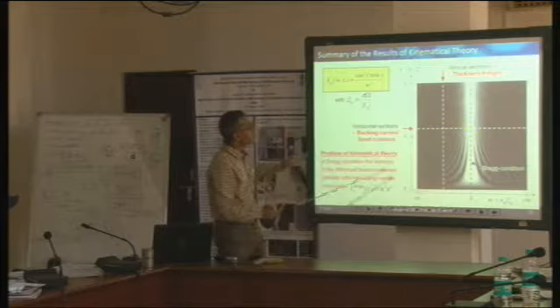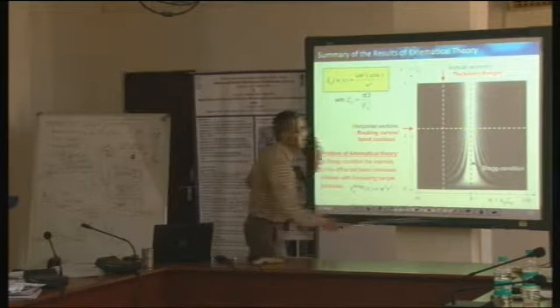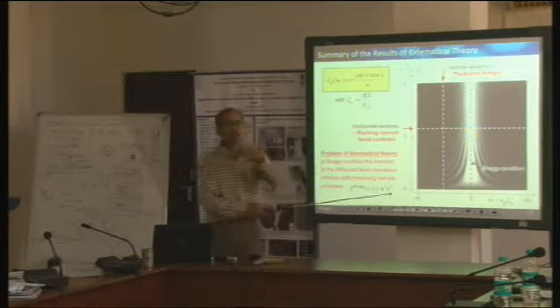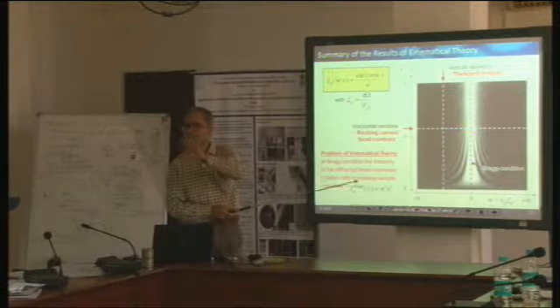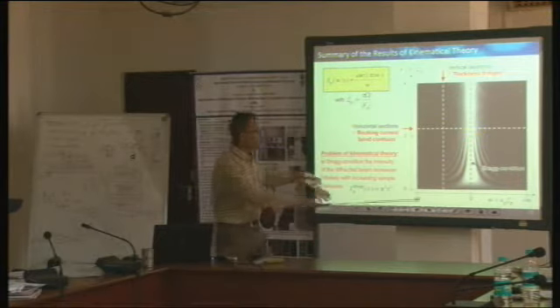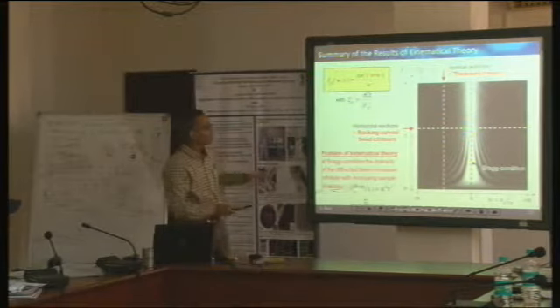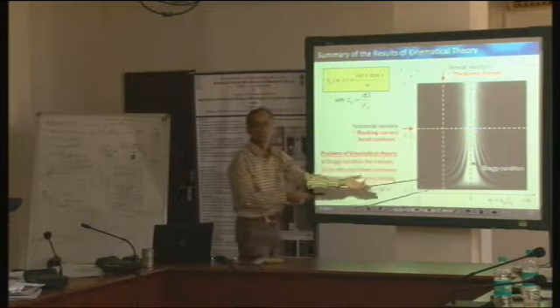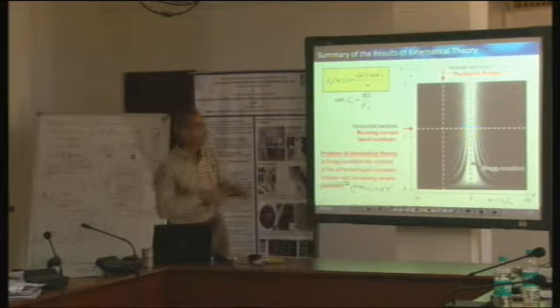What is plotted is a two-dimensional plot. On this axis is thickness, on this axis is, shall I always call it excitation error? How far we are from the Bragg diffraction condition. I will keep calling it excitation error. Is that okay? So excitation error on this side and thickness on this side. In a way, this is related to bending of the sample, this is related to thickness of the sample. This is also clear. This is an analytical function, and I can always plot it in a two-dimensional plot like this. You can use any software, MATLAB or whatever, and it can be plotted.